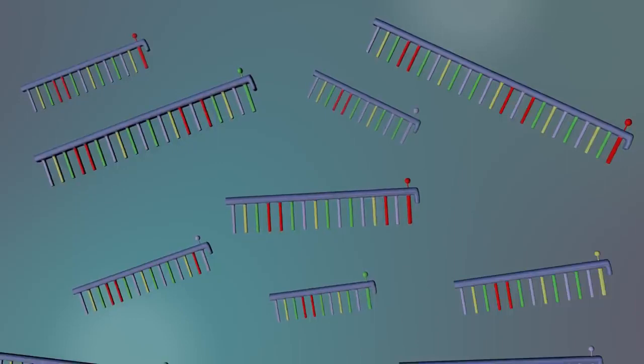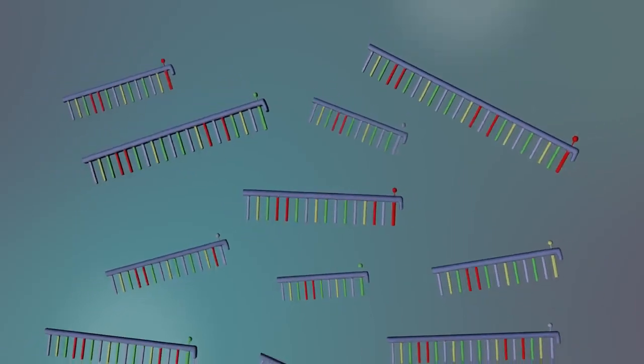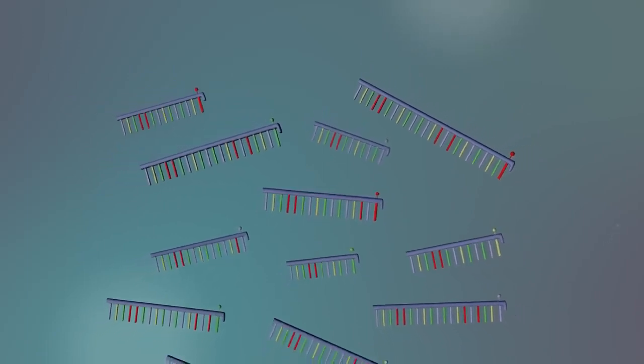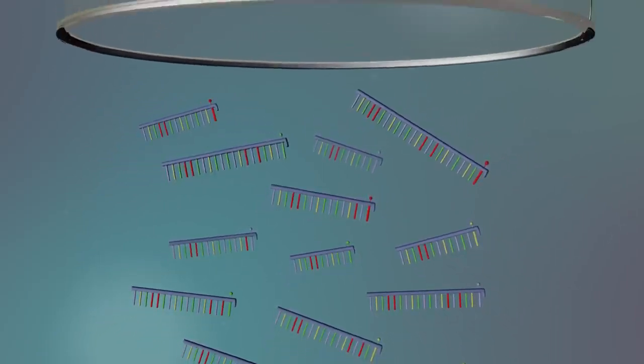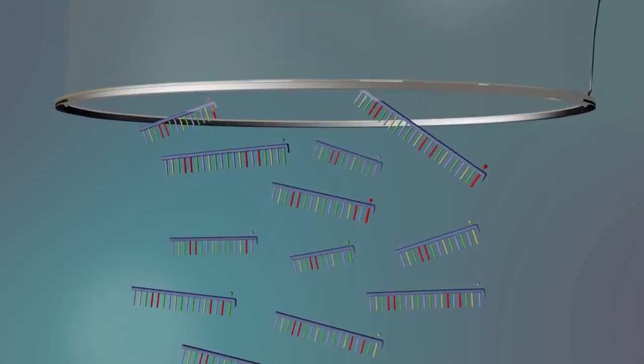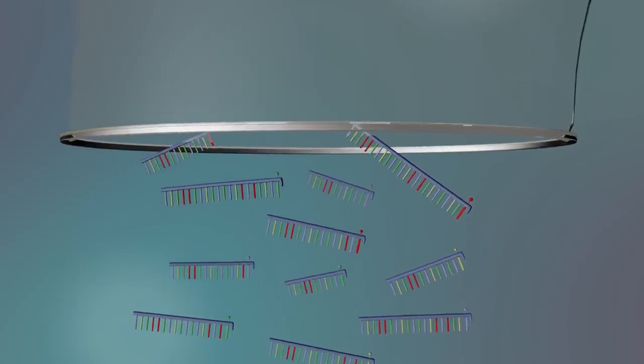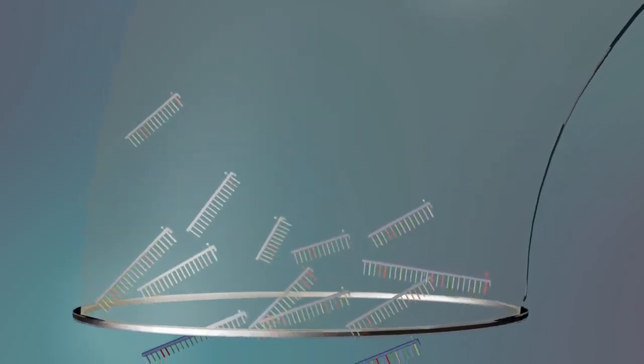To read the sequence of the DNA, the various fragments are separated by length using a process called electrophoresis. A capillary tube is lowered into each well of the plate and an electrical charge is applied. This causes the negatively charged DNA molecules to move through the capillary tube.